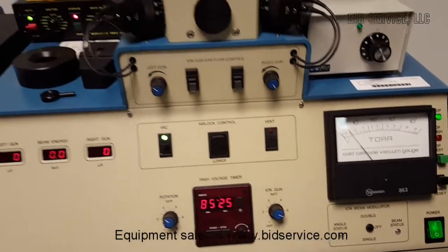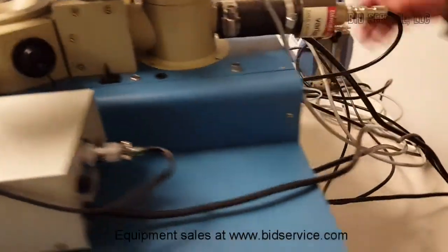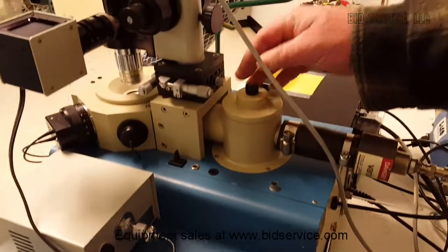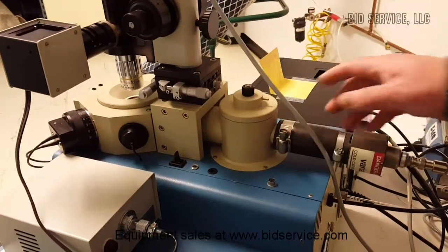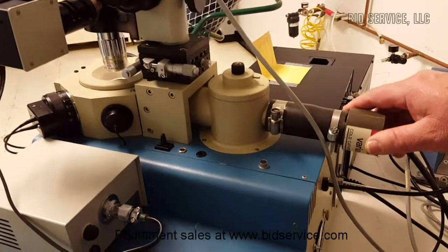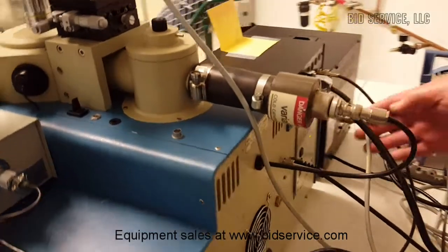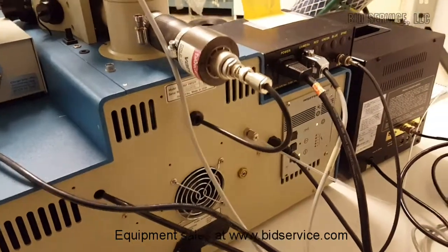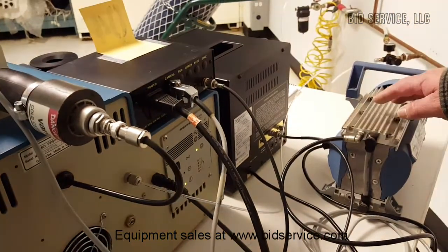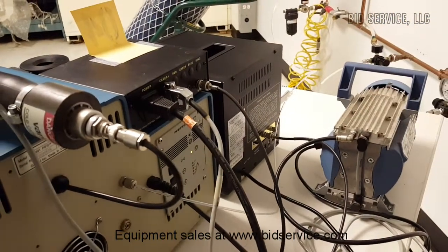Everything's working fine. Now on the back of the system we have an air admittance valve to get into the chamber. Then you have your cold cathode gauge to read your vacuum pressure. And right back here you have your turbo controller, and over here you have your diaphragm pump for your system.